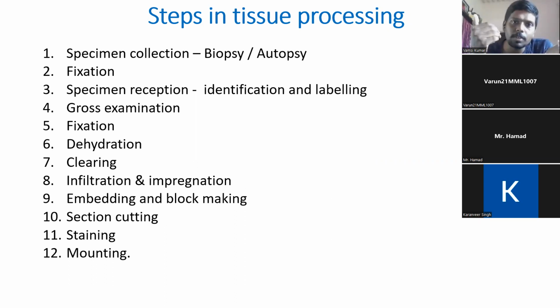They're taking samples from surgery after surgery, so the patient is not ready to undergo surgeries. Unidentified and improperly labeled samples are never processed. We should not process such samples. Then, everything is tallied: the requisition form, the data, the labeling, and the content in the jar have been tallied.